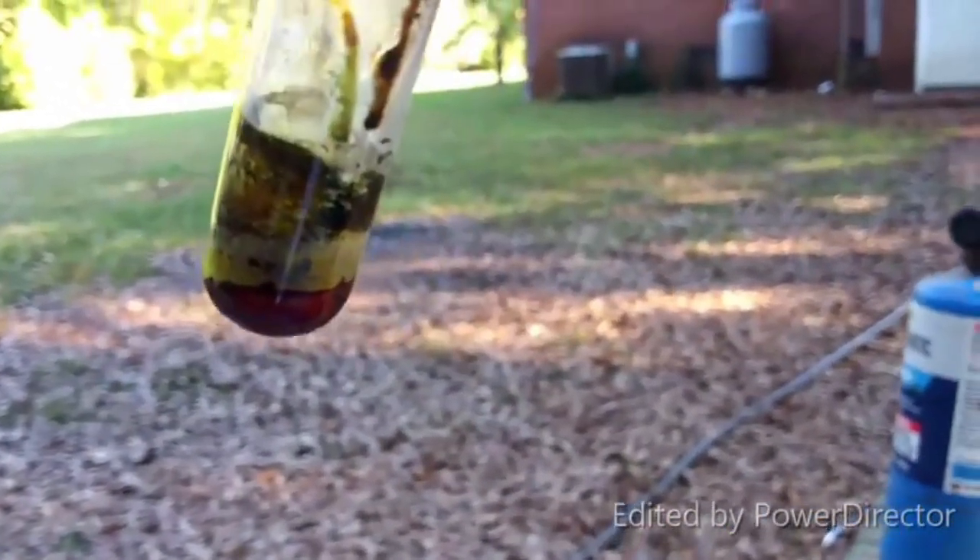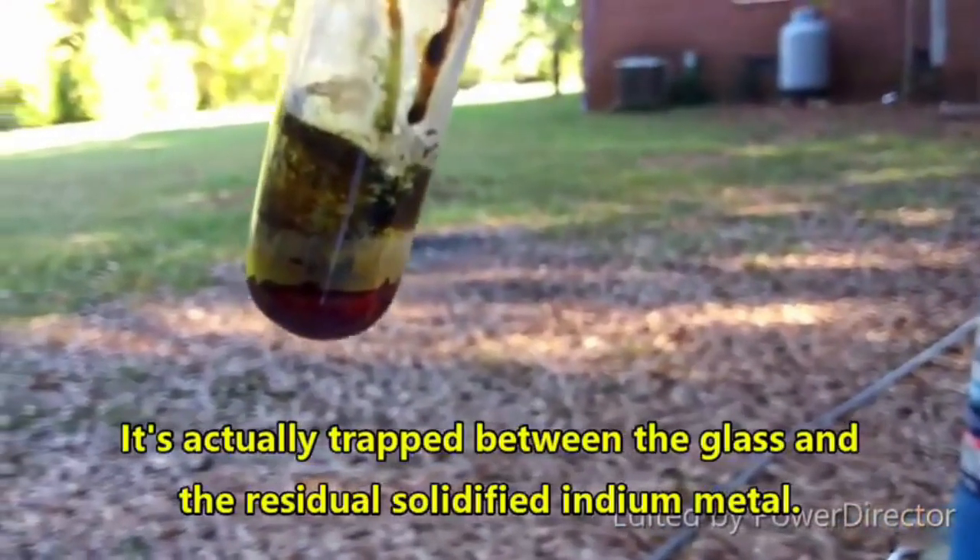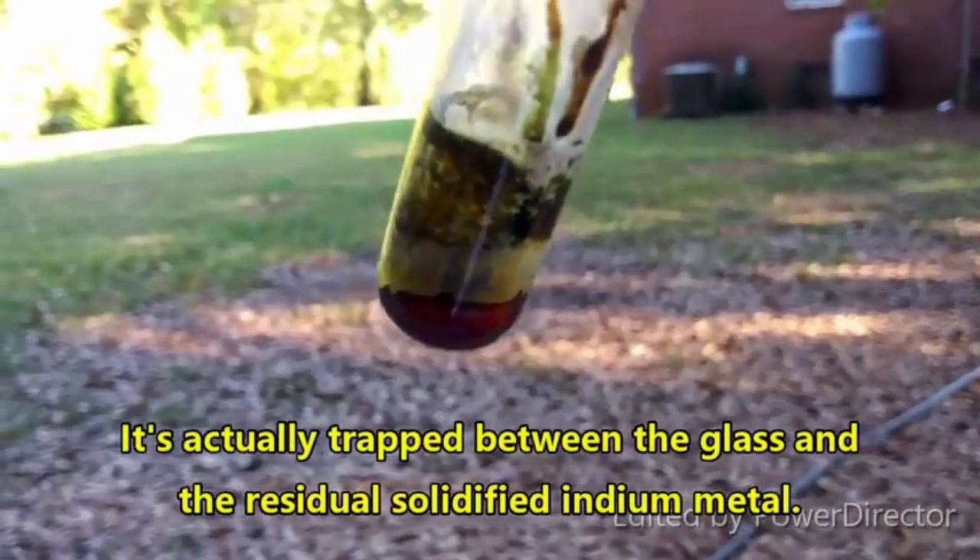Okay, there's the excess metallic indium. The yellow stuff is probably indium triiodide. And then we've got this red layer here, which has got to be indium monoiodide, because indium triiodide is a yellow solid. Red solid — there's nothing else it can be. Oh, that's so cool!